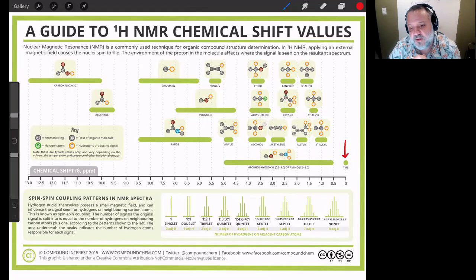And so let's take a look at the different functional groups. Now, to the right, it's busy, right? There are lots of overlapping signals. But what should we get from this particular bit of information? It's right here.